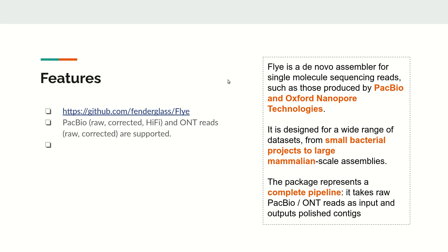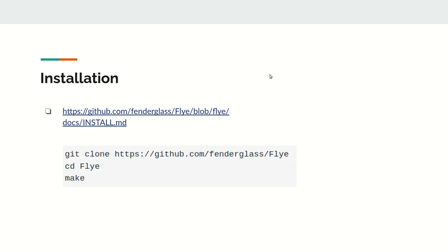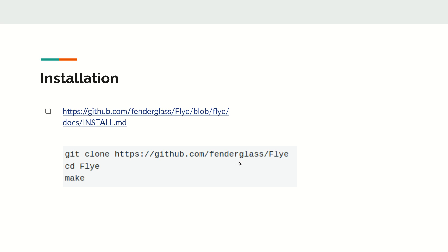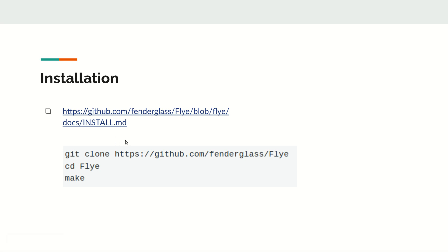The installation link is given here and it's very simple. You need to clone the repository, and once you clone it, change into the directory Flye and simply type the make command. This will install the tool in your system.